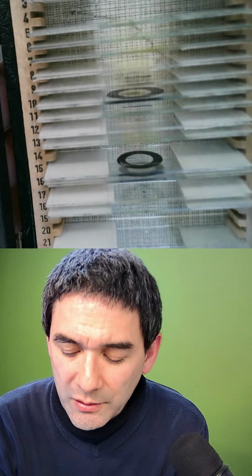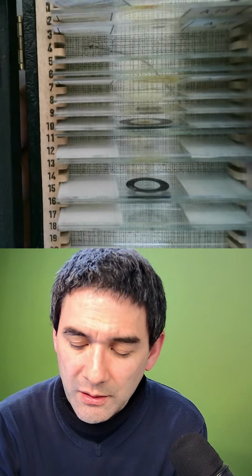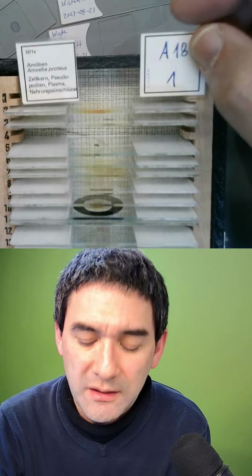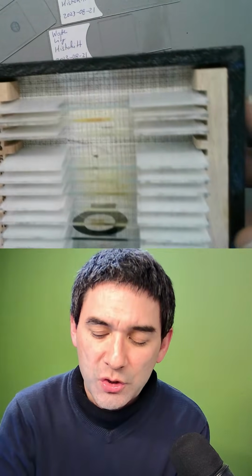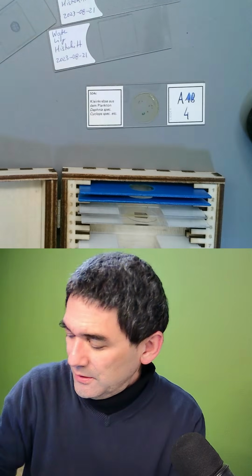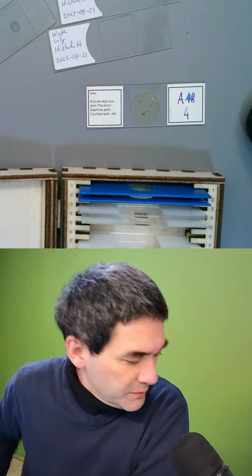So it says here Series A, box 18, the first slide. That's just some kind of indexing system that we've been using. So just put them away here.